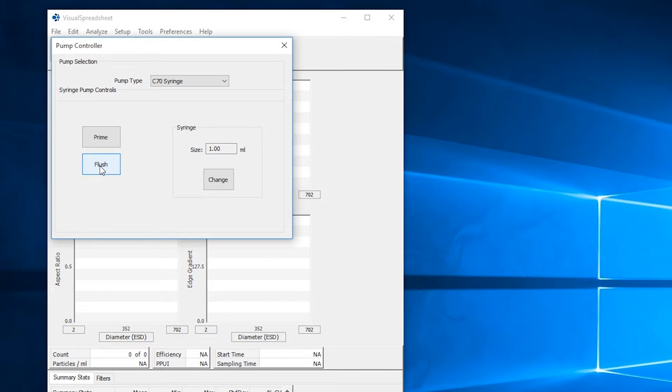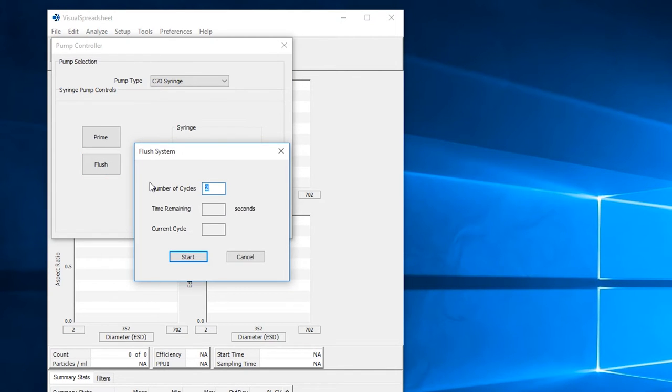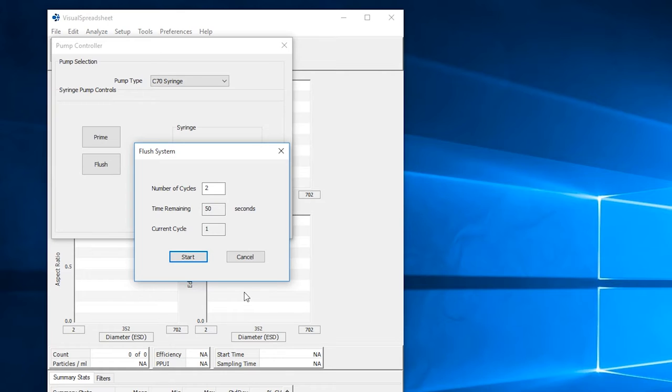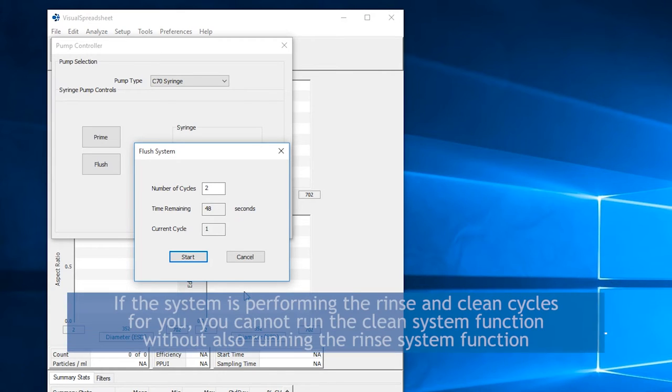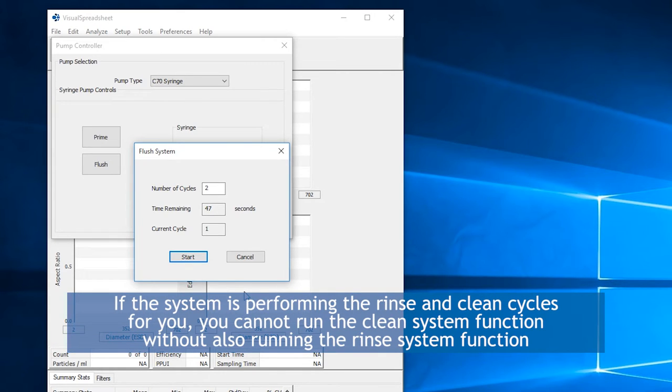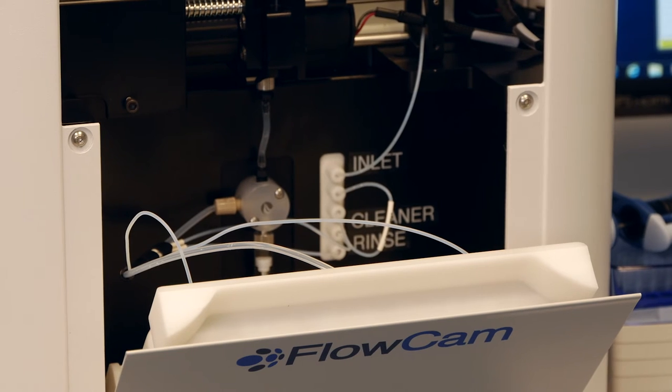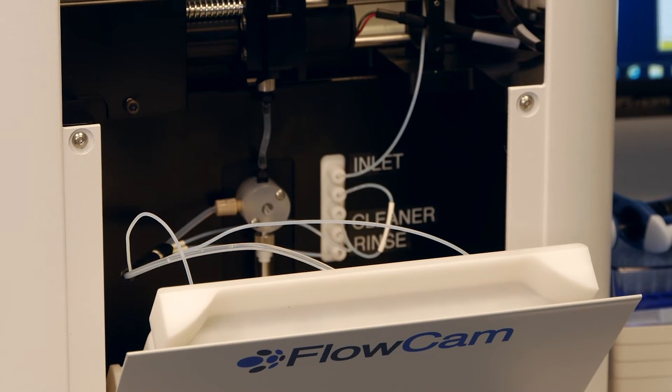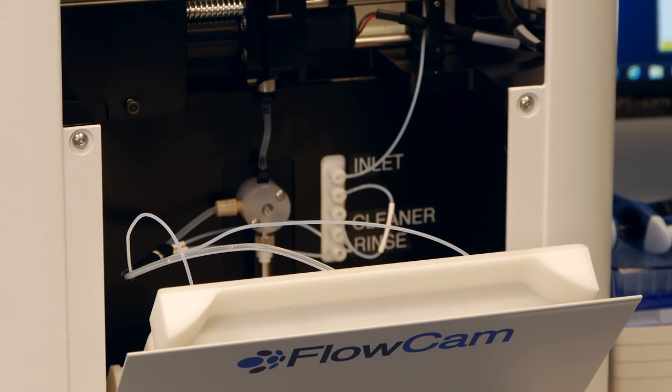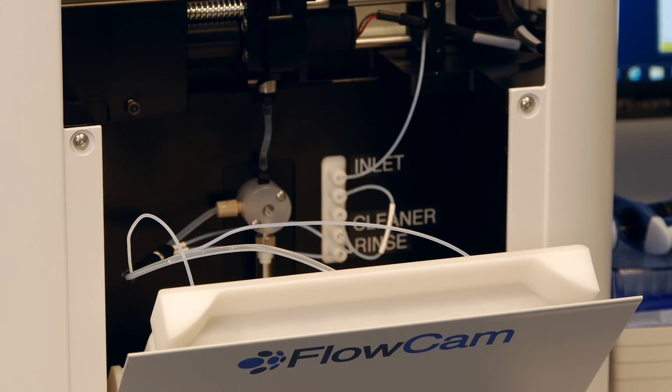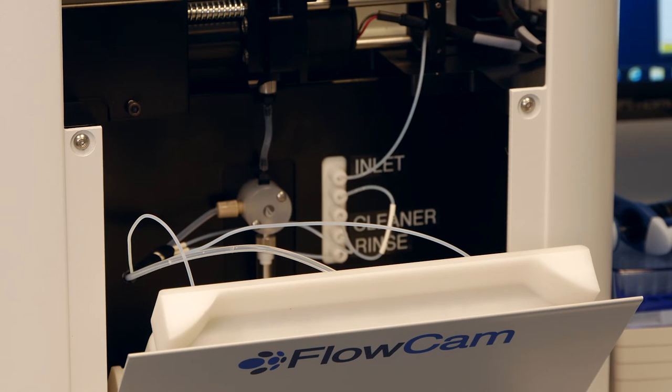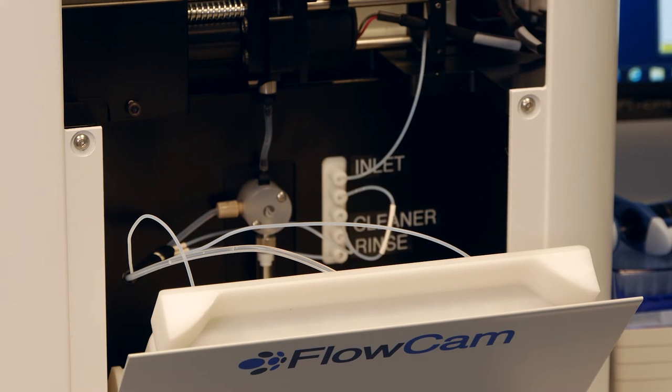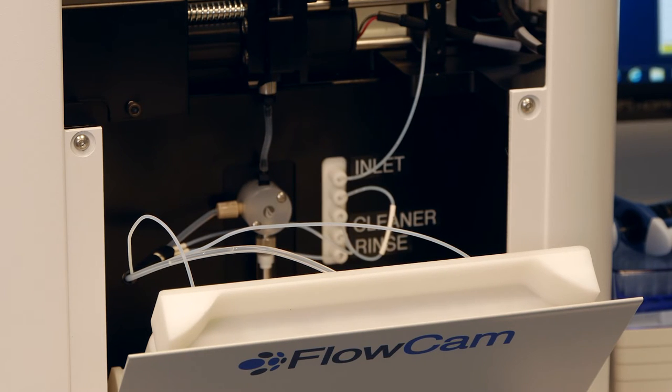With the pump options open, you can select the number of rinse or rinse clean cycles you would like to manually initiate or have performed when the run is over. This can be set by checking the appropriate box. Please note that if the system is performing the rinse and clean cycles for you, that you cannot run the clean system function without also running the rinse system function. The solution from the rinse bottle will be the last to come in contact with the flow cell before analyzing the first or next sample after the flow cell is flushed with the automated sequence.